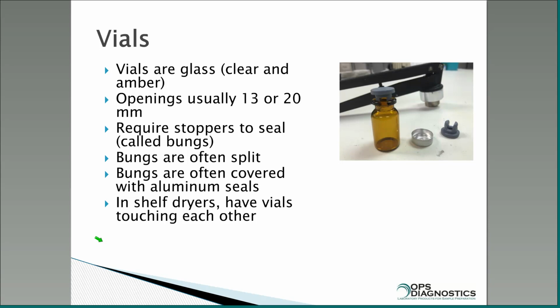But here's the bung right up. Let me get my arrow. That's the bung over here as well. And there's a little gap in that bung, right? See it right there. And you put this in, and the gases can get out.